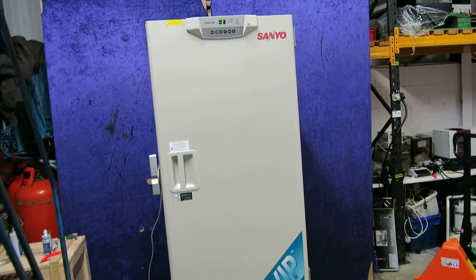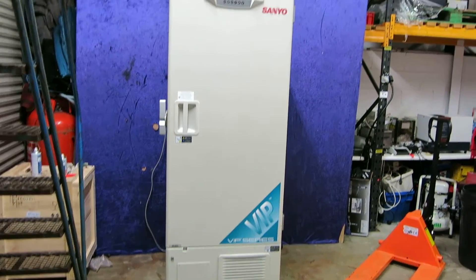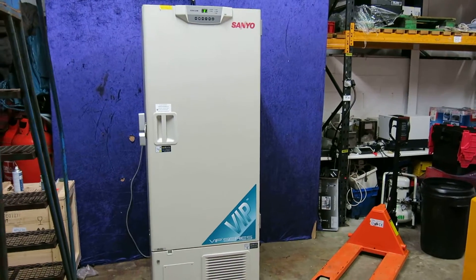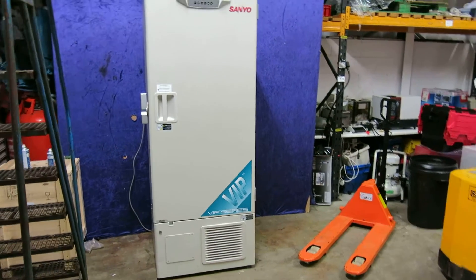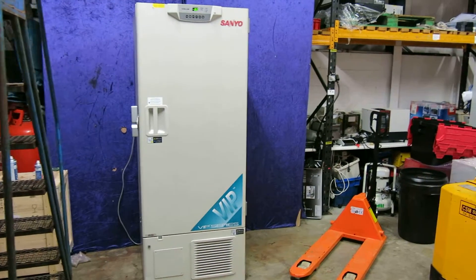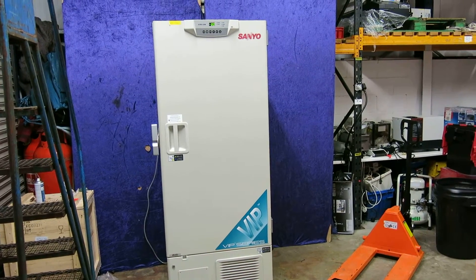So this is the Sanyo freezer here, just in our warehouse. Give you an idea of the size here. Nick Edmund, Richmond Scientific, signing off. You can hear the wind just rattling there on the shutter.